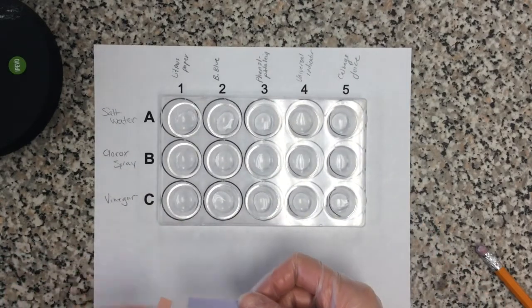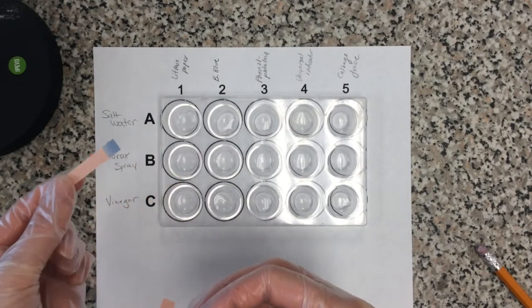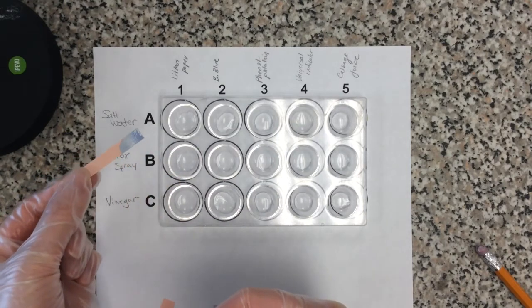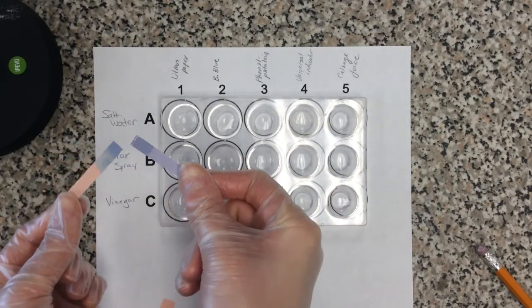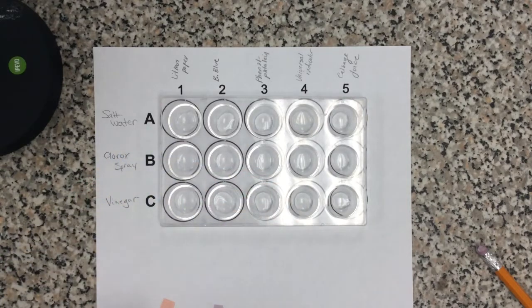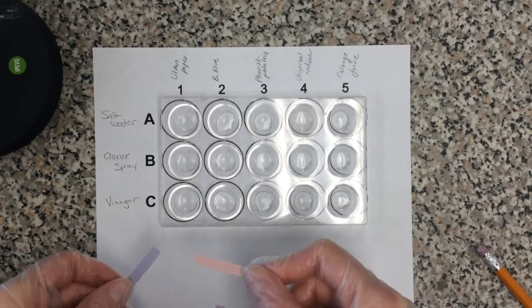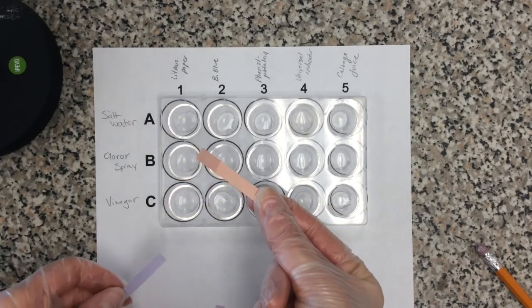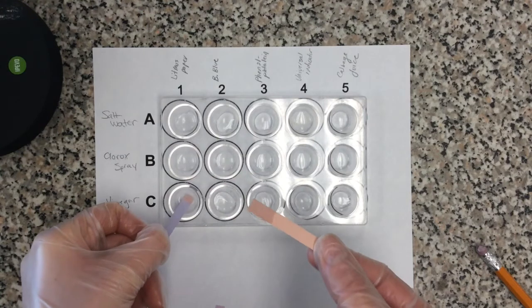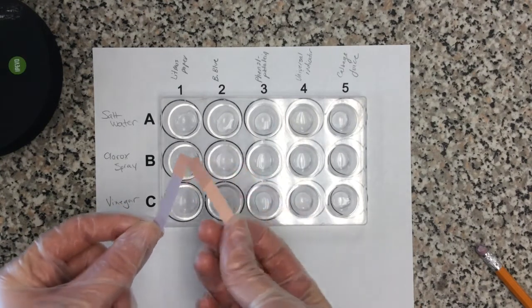Just seeing if you're paying attention. So our red litmus paper turned blue. Our blue litmus paper stayed blue. All right, so vinegar, red litmus paper stayed red. And blue litmus paper turned red.